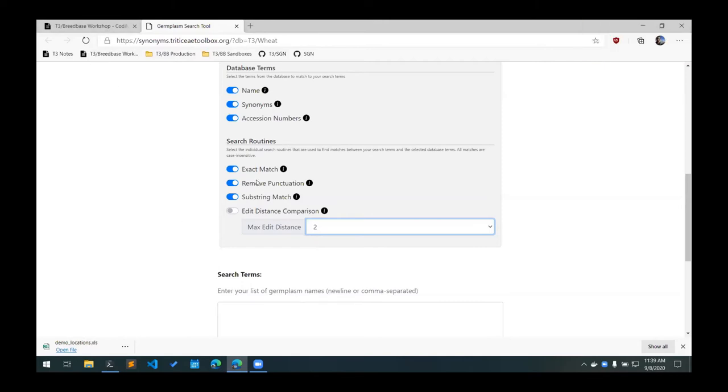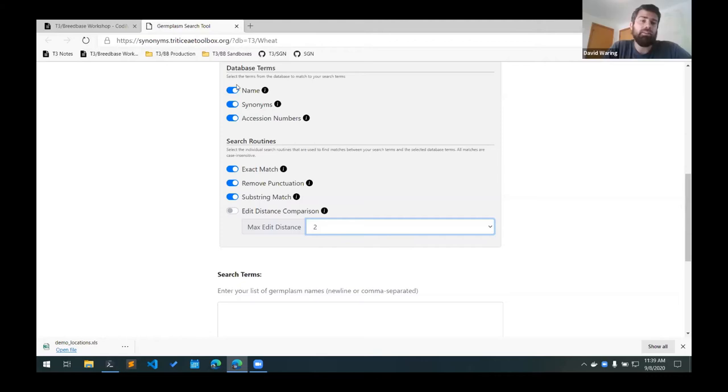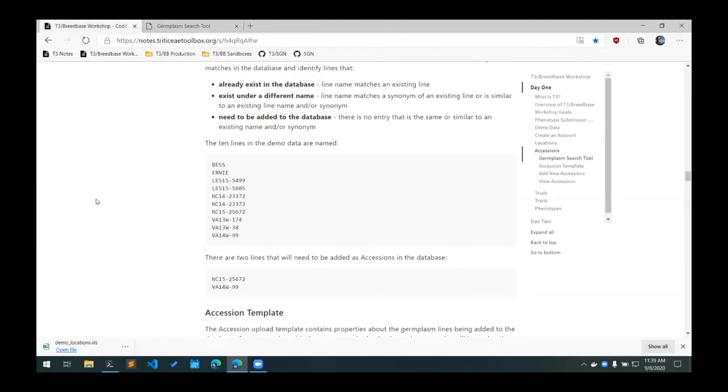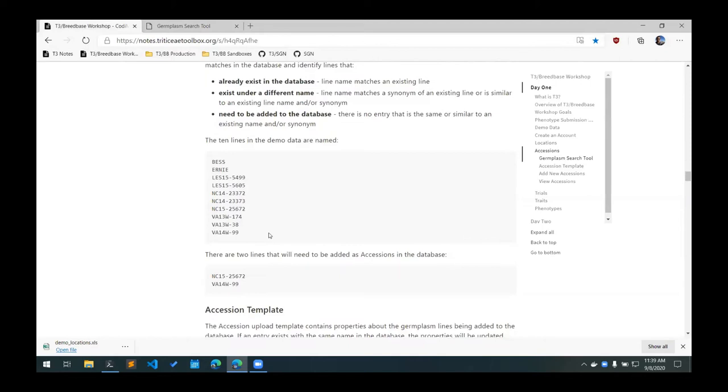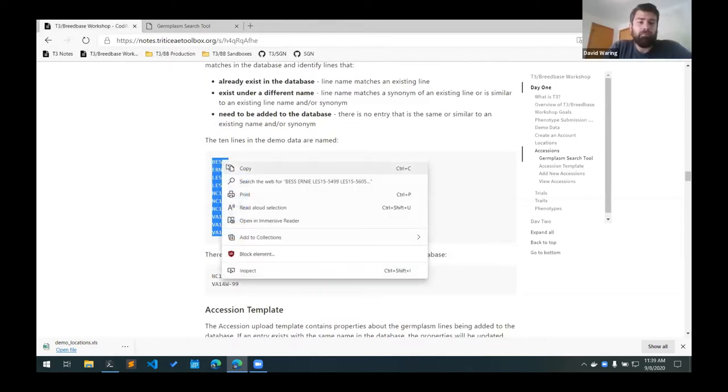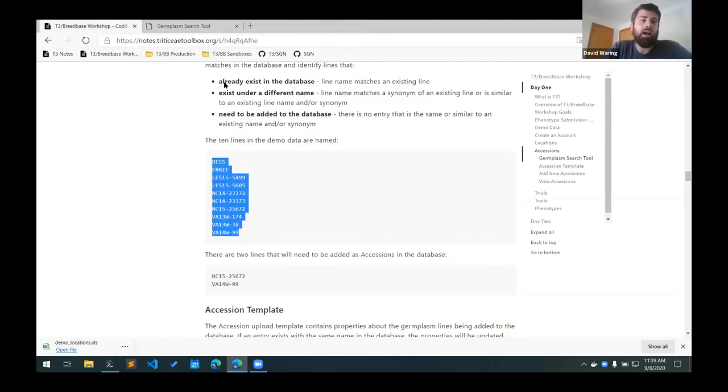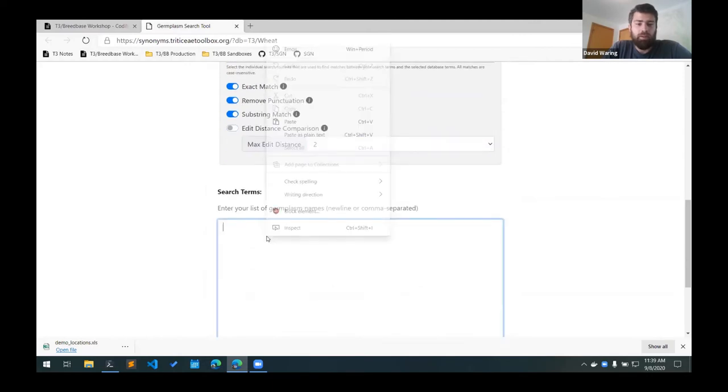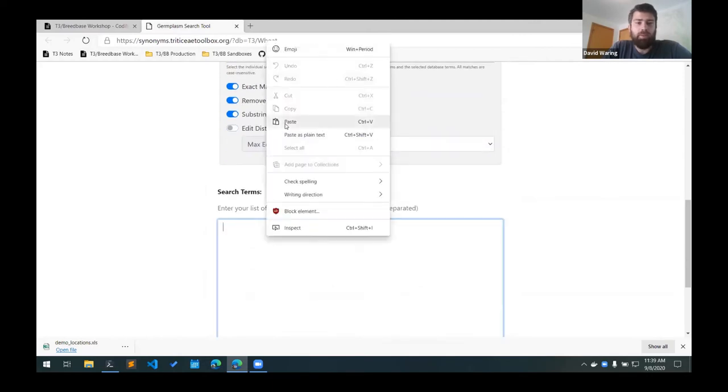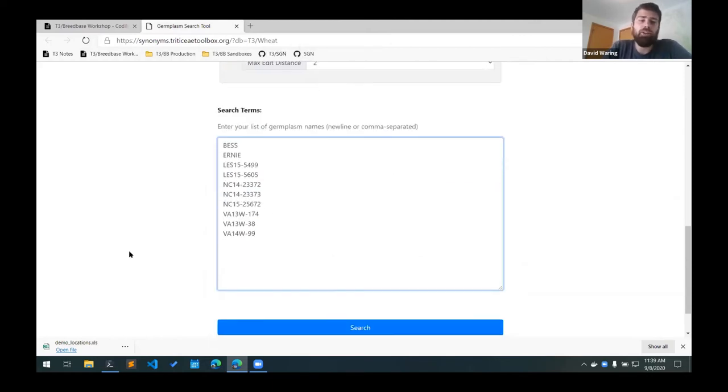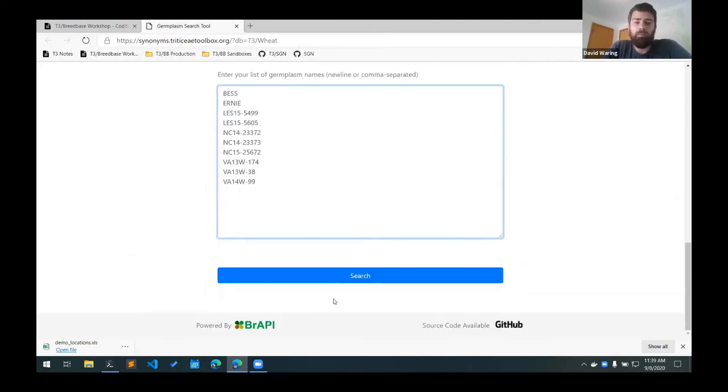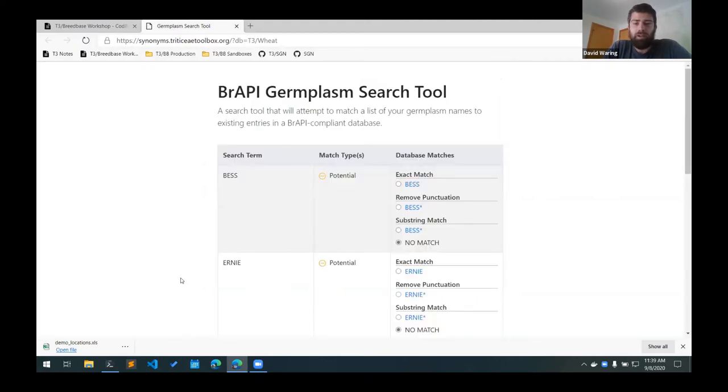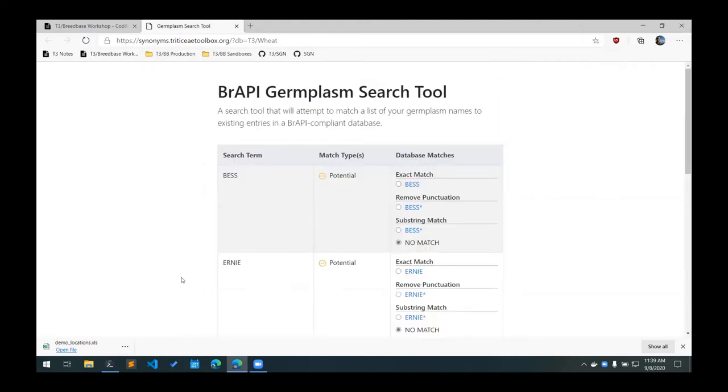So for our example, we will use these three search routines and search all of the database terms. This is the list of lines that are in the demo data. I'll copy that, and then just paste it into the search box here.